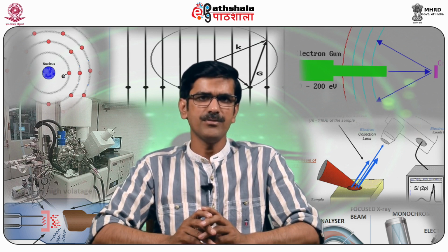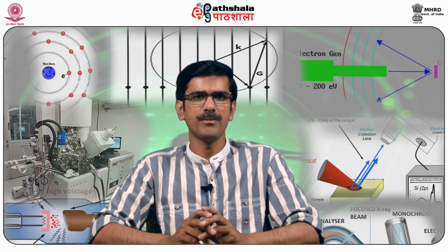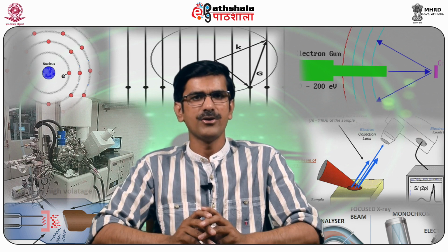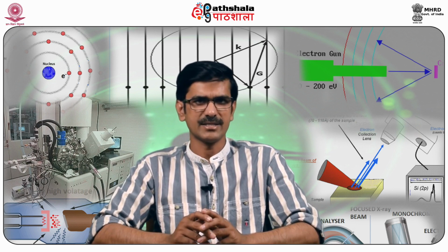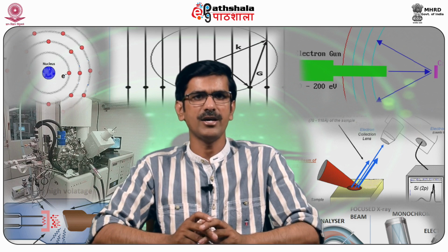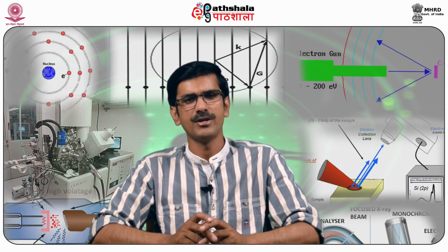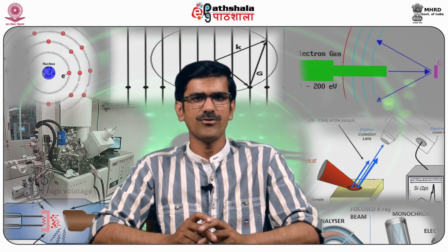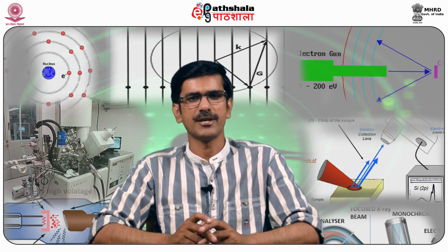PES is rather picky when it comes to keeping the surface of the sample clean and keeping the rest of the environment free from interferences from things like gaseous molecules. The high vacuum that is used is always an ultra high vacuum, UHV, environment. An electron detector is used. The general description of PES is shown in this slide.